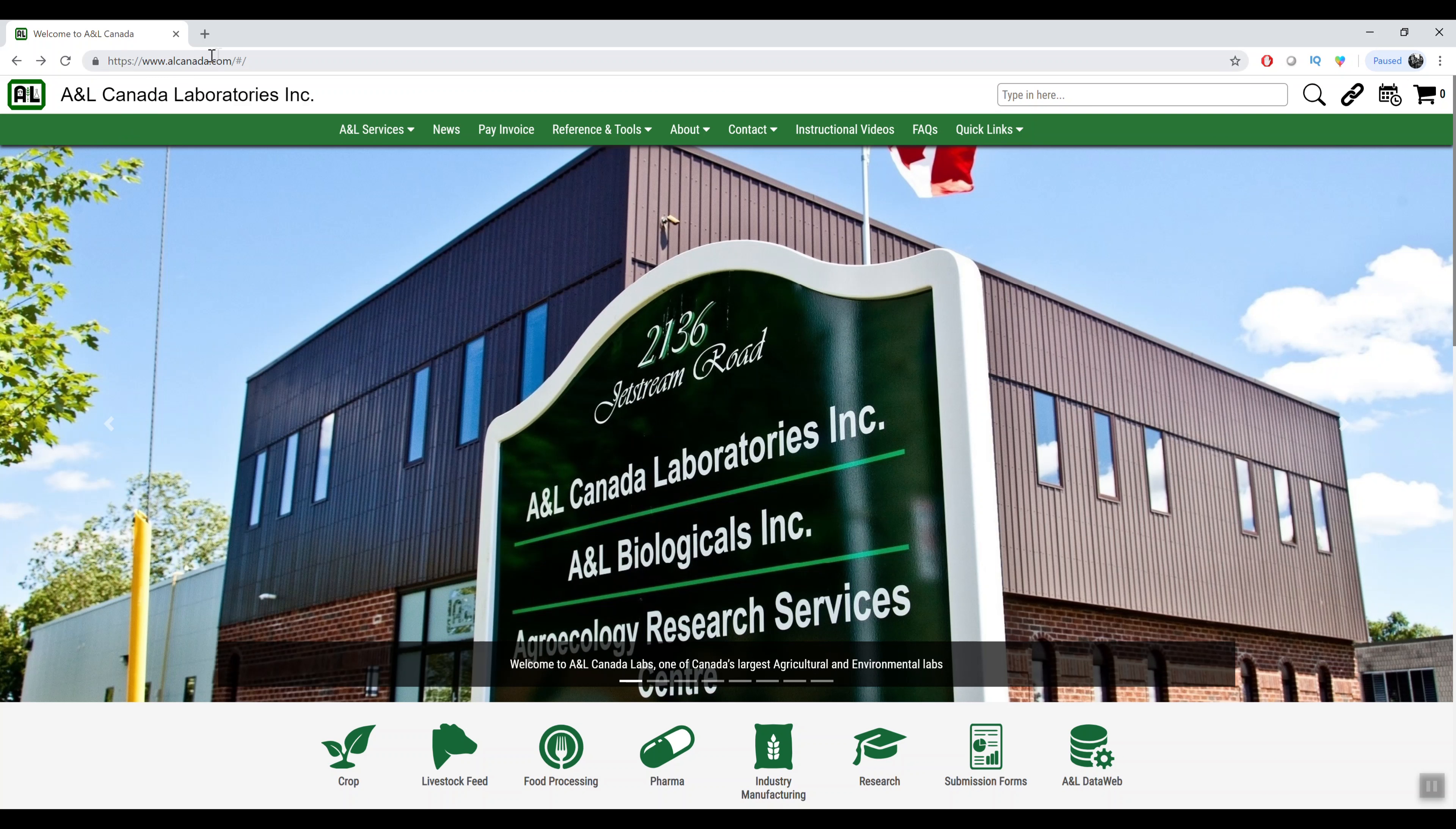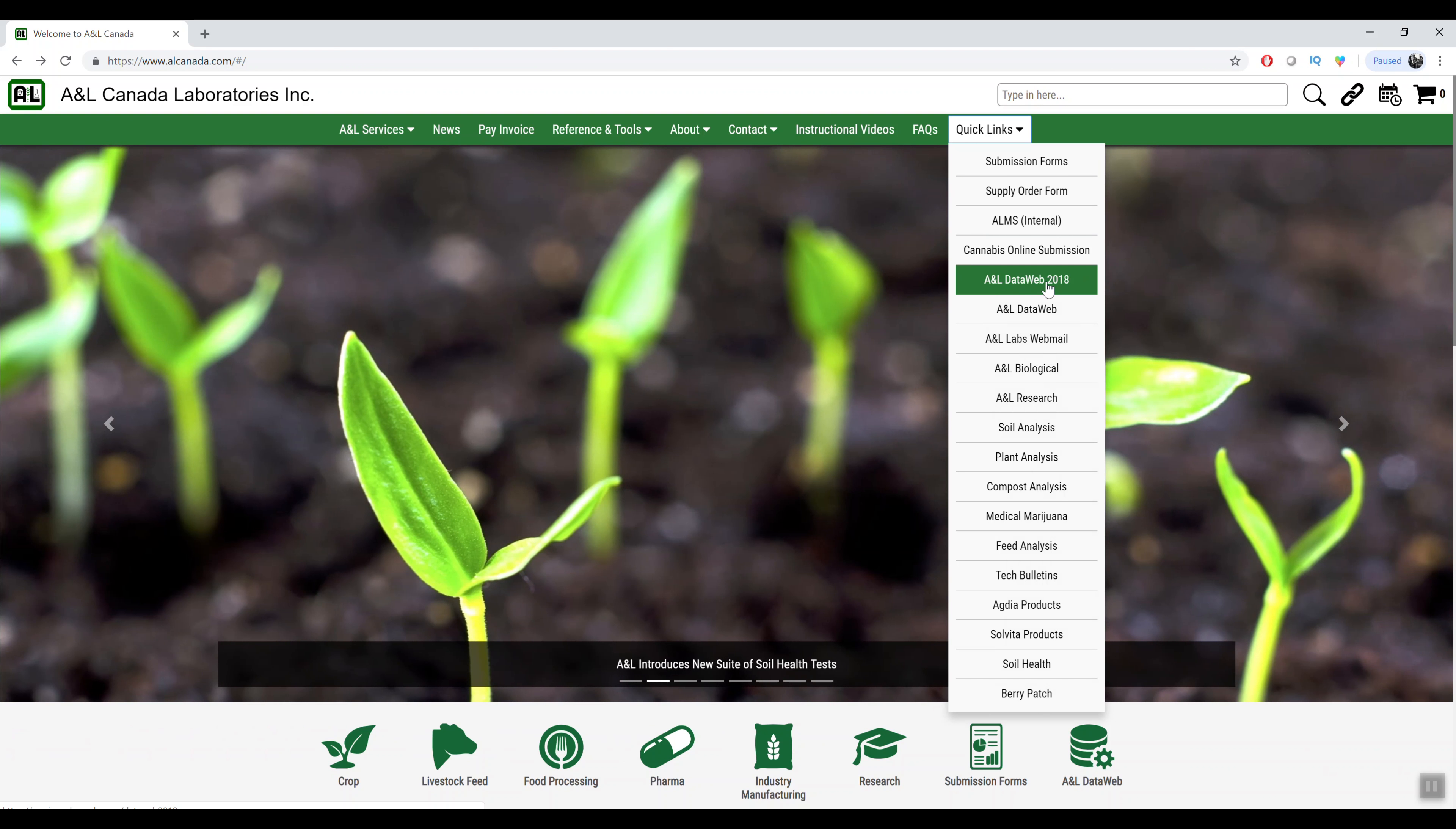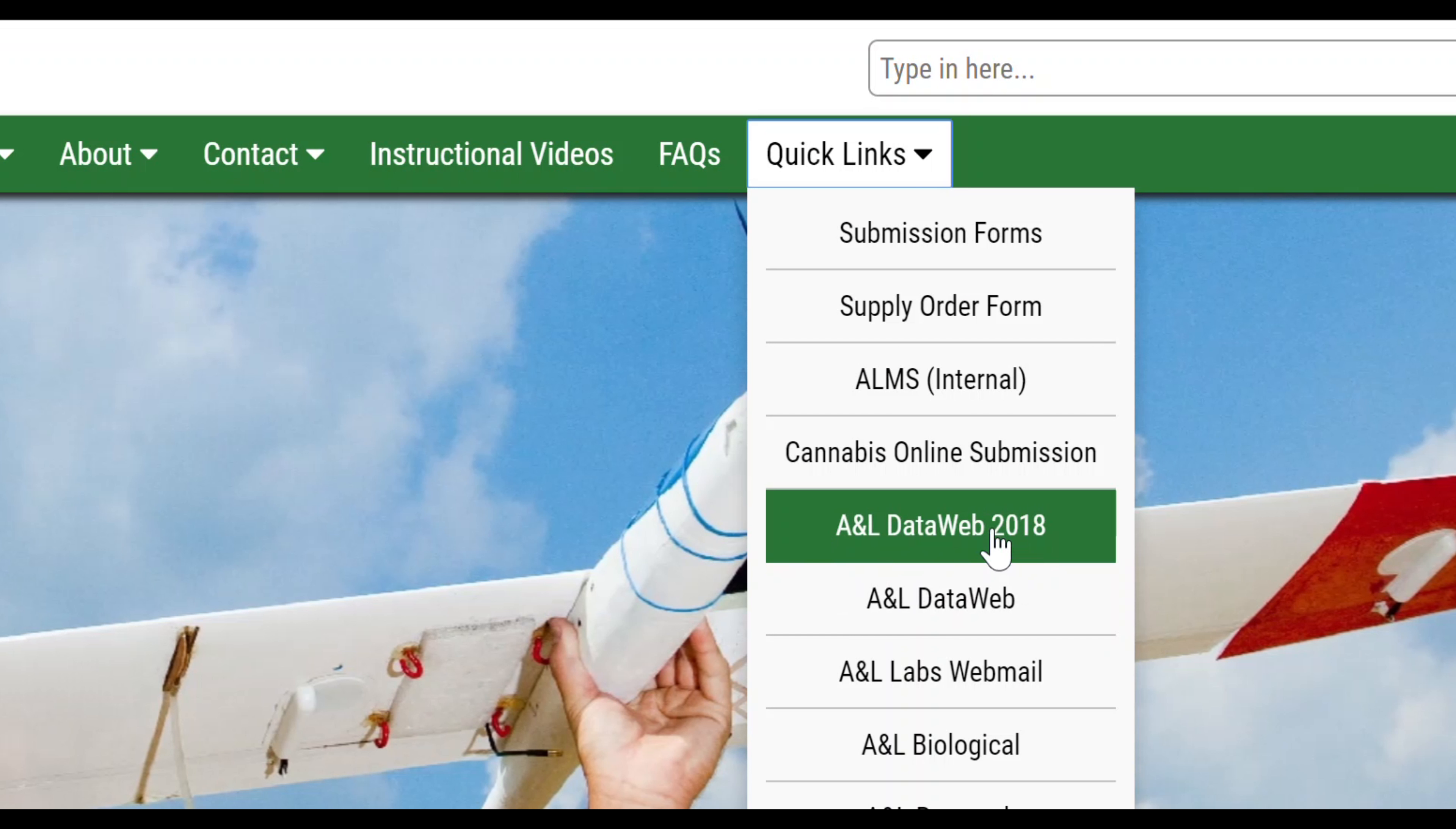Hello, just wanted to do a video today on our 2018 upgrade to our DataWeb. It's available at www.alcanada.com from the quick links menu and choose ANL DataWeb 2018.